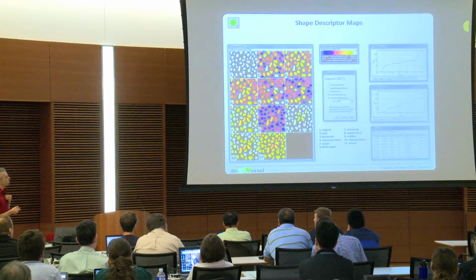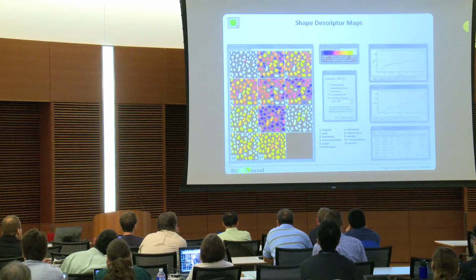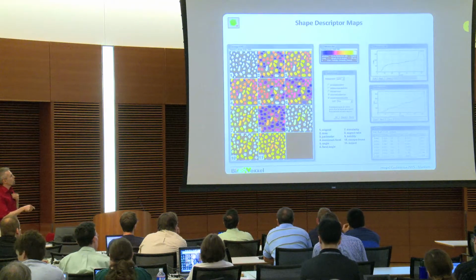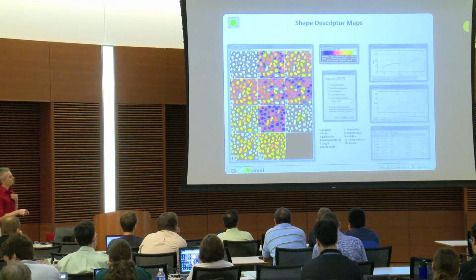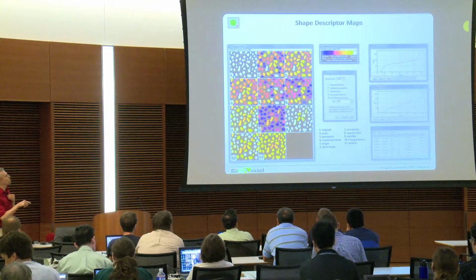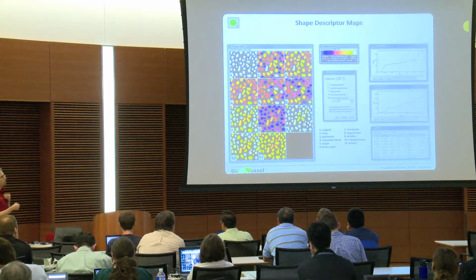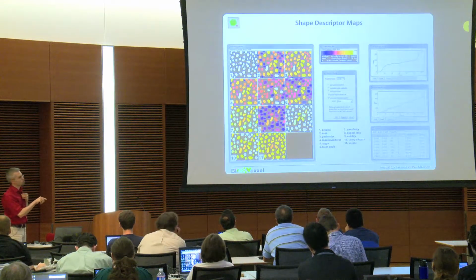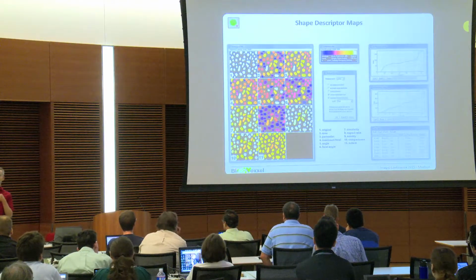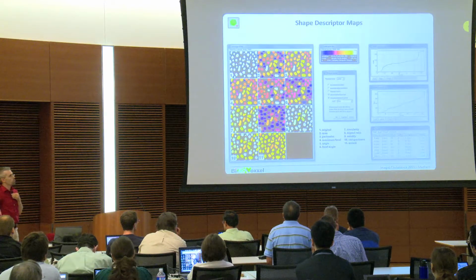And in the shape descriptor maps, you don't get a montage, you get it as a stack, but you get your particles color-coded according to a specific LUT you choose, which show the different shape descriptors or sizes or so in color. And then you see white is big and blue is small. So you can visually already separate them better, and then also, if you click on those images, you can get these plots, which is simply a cumulative distribution of those sizes or shapes.